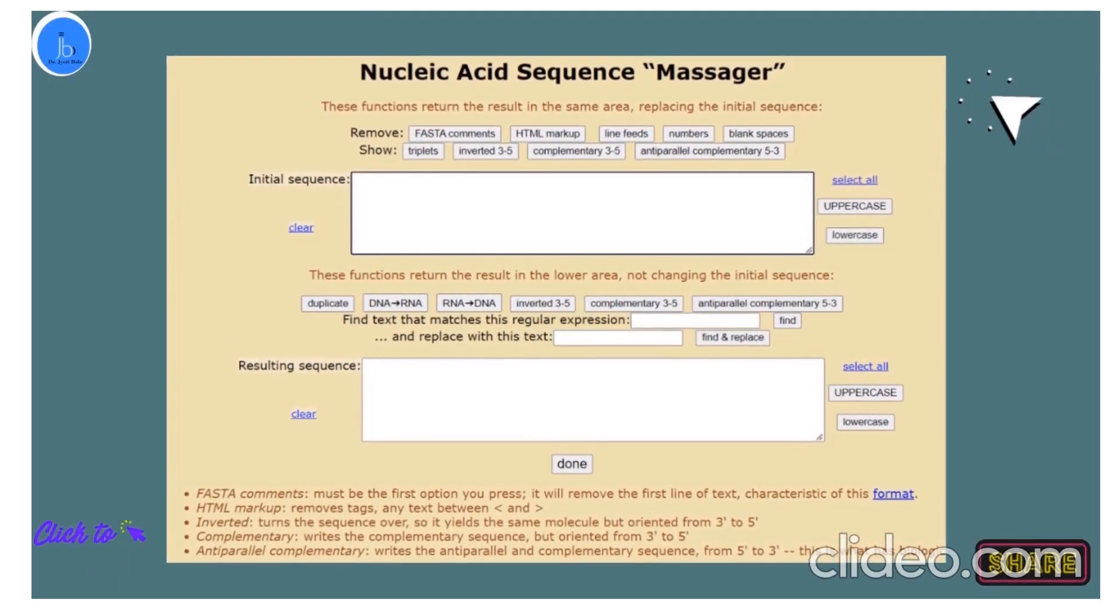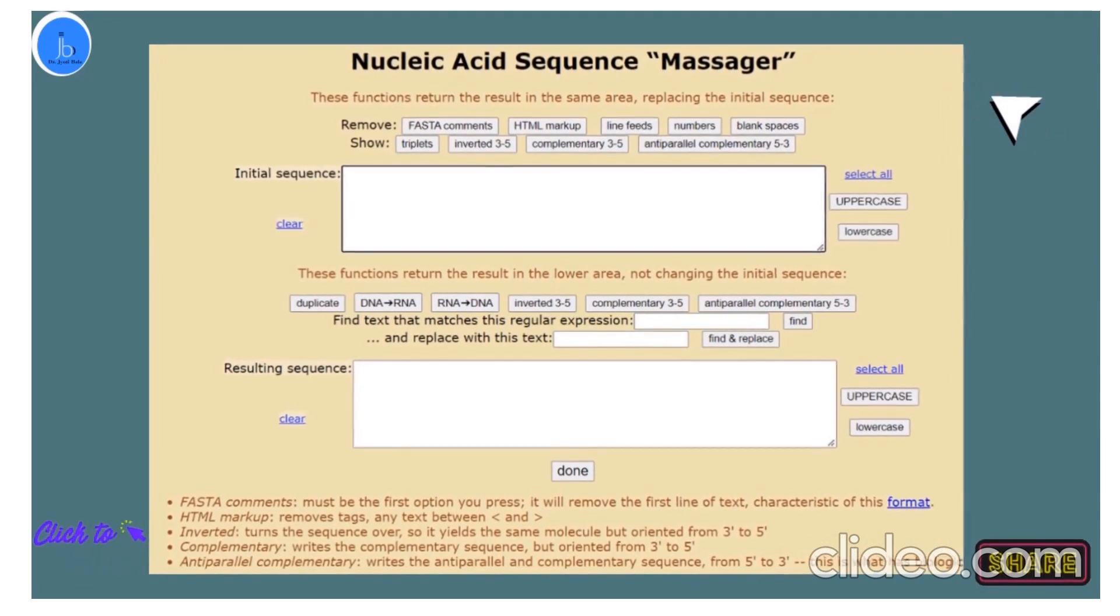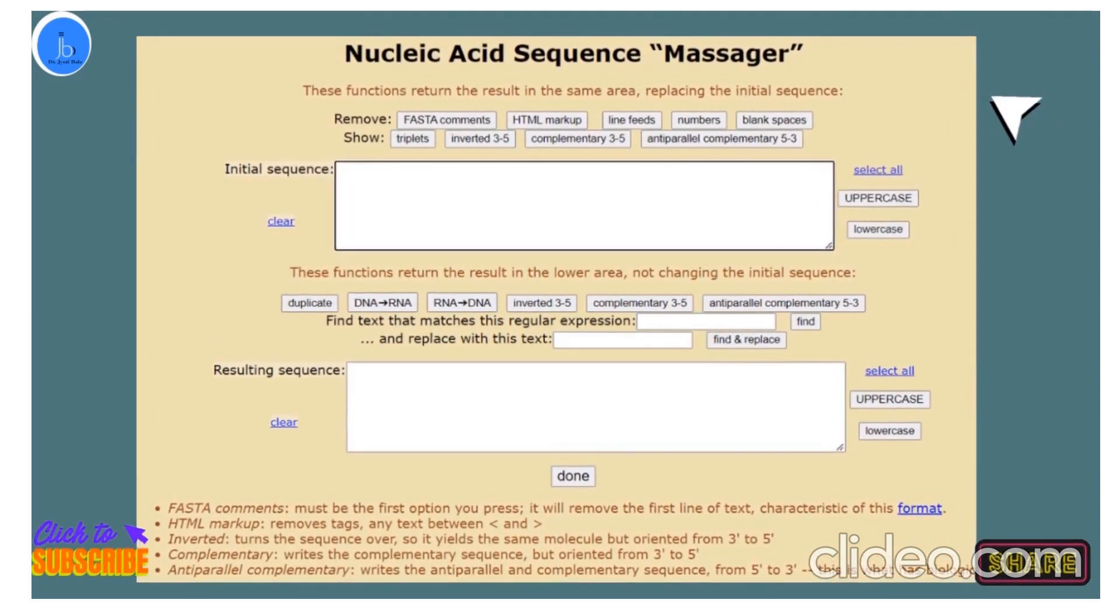You may use sequence massager if your project requires DNA conversion to RNA, because for RNA Matthew, you can fold DNA also and RNA also. So depending on your project, if you have to convert DNA to RNA, you can use the sequence massager. I will be putting the URL of this and I have already made one tutorial. I request you to watch the sequence massager tutorial also. This will give you an overview about how to use this tool also.